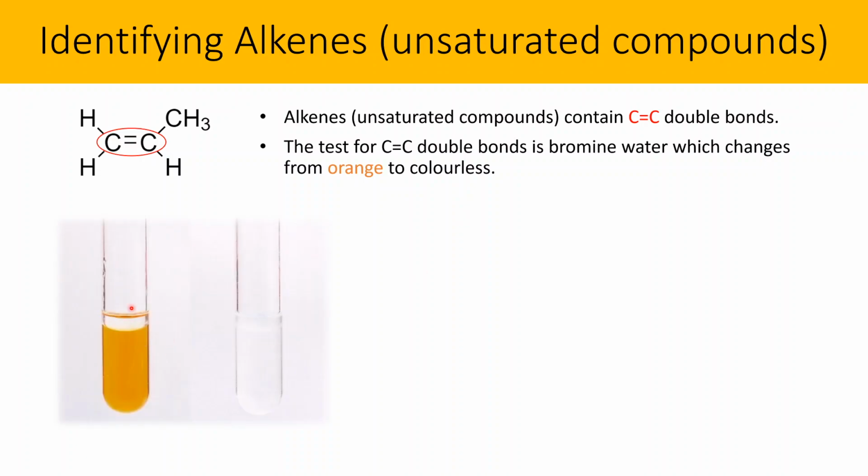You can see that the alkene is floating. That's usually because organic substances like alkenes have lower density than the water that the bromine is dissolved in, so they float on top. And for that reason, the alkene doesn't actually mix very well with the bromine water when you first pour it in. So we've got to describe a method for how we're going to use bromine water.